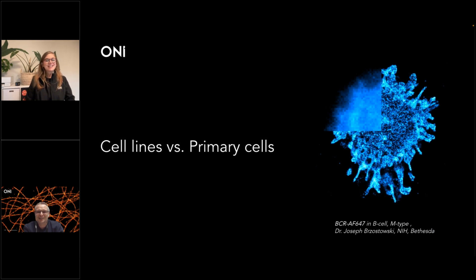Awesome. We have another audience question, this time from LinkedIn Live. Hello and welcome, LinkedIn audience. And the question is related to live cell imaging capabilities. And so I believe now we were talking mostly about fixed cell, but what are the limitations of dSTORM to visualize dynamic cell processes?